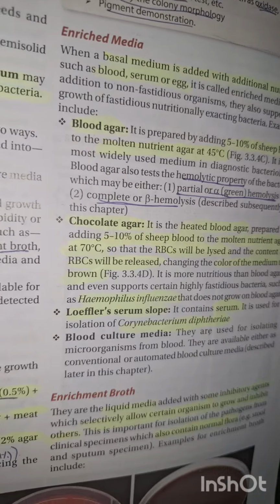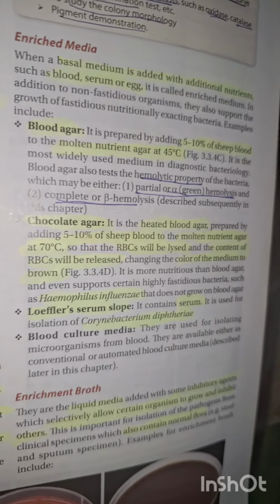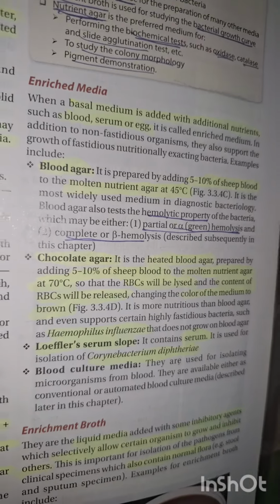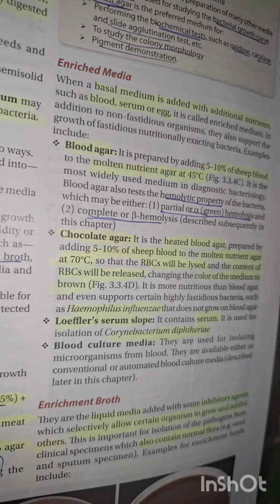For example, it supports the growth of highly fastidious bacteria like Haemophilus influenzae, which does not grow on blood agar, as chocolate agar is more nutritious than the blood agar. The third example is the Loeffler's serum slope. It contains serum and is used for the isolation of Corynebacterium diphtheriae.